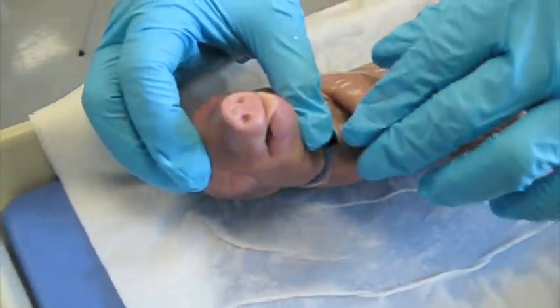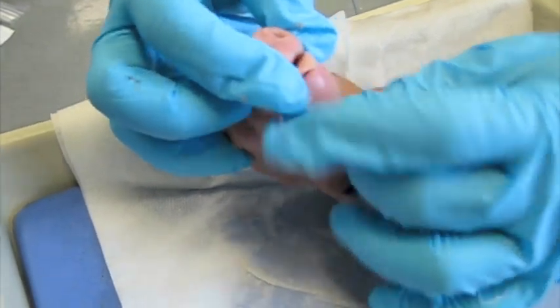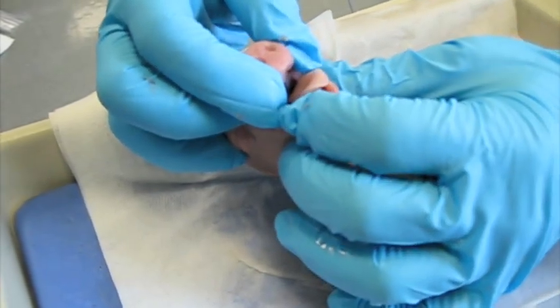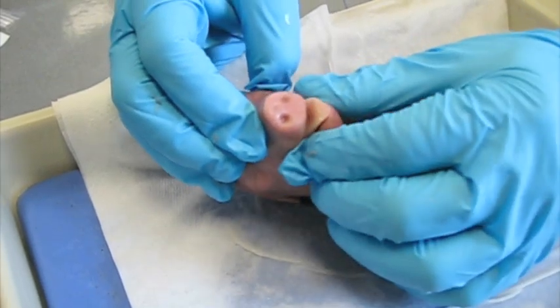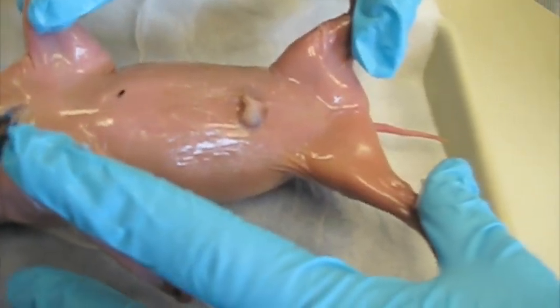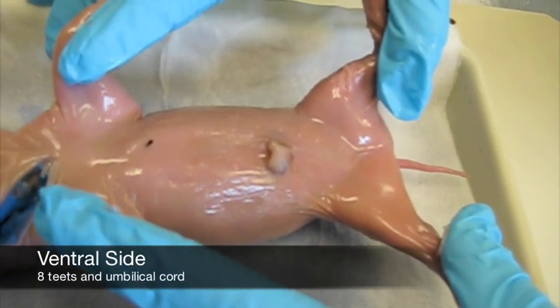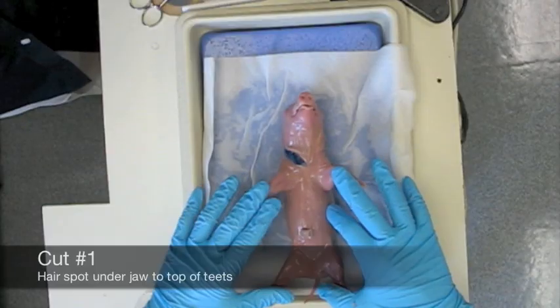Starting with the mouth, notice that the tongue is still smooth. The teeth are underdeveloped and the gums are still soft. This would indicate that the pig was likely 90 days into gestation out of a normal 120 day gestation period. Next, look at the midsection of the pig. Notice the eight teats across the belly and notice the umbilical cord. We will take a closer look at the umbilical cord later. We have identified this pig as female by noting the small opening called the genital tubercle right under the tail.